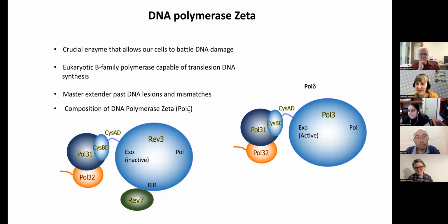We've got a question about model building. Andrew noticed that you used COOT for model building and asked if you used COOT to fit the DNA helix extending out of the enzyme as well as the protein, because they're struggling a bit with getting helical DNA fit into a map that they're working on, and was curious if you had any tricks for building the DNA, especially using COOT.